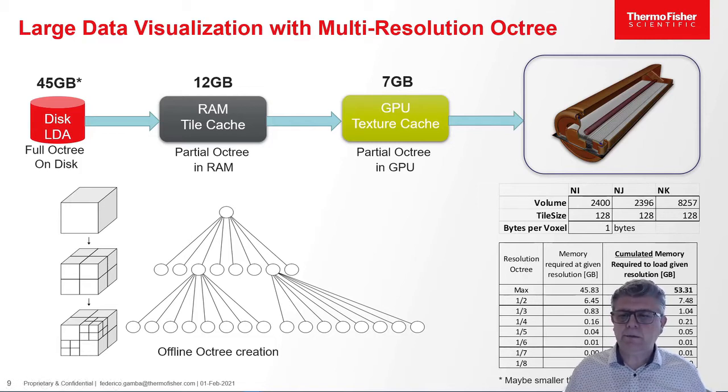And so you split your entire volume into these small bricks, tiles, and then you build another bricked tiled volume up here that is lower resolution. Basically every 8 tiles you create 1 tile of the same number of voxels, but the voxels are twice as big. Okay, so you decrease the quality, but you keep the same number of voxels in every tile, and you continue to go up. Maybe you will get, I don't know, 8 resolutions like that.